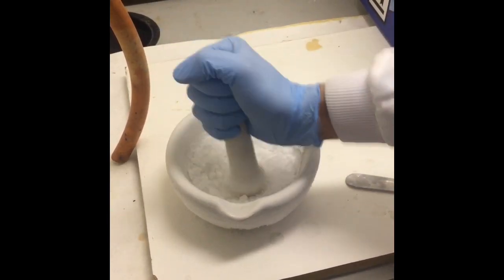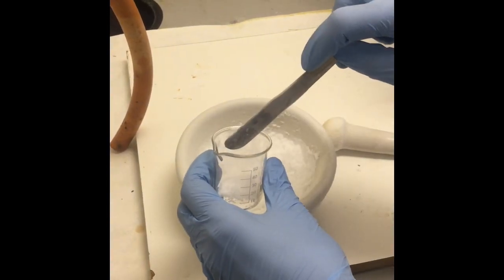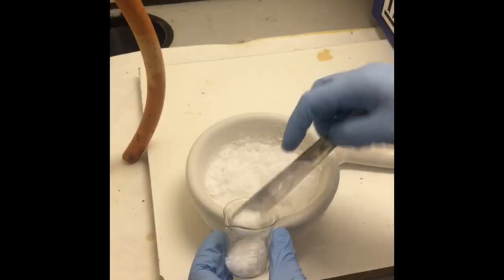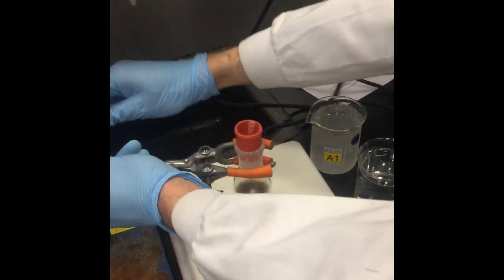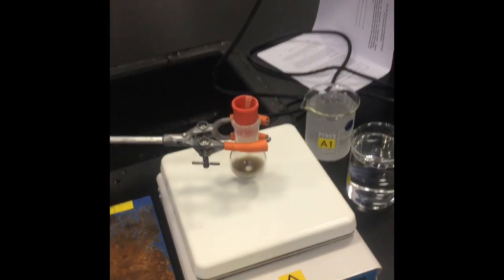Crush dry ice pellets and place the dry ice into a beaker. Once the solution is cool, remove the ice bath and lower the round bottom flask onto the stirring plate.